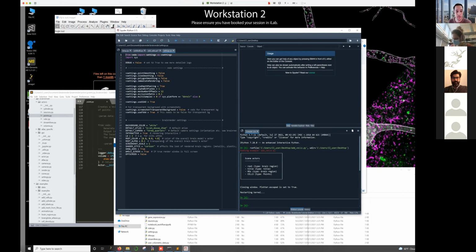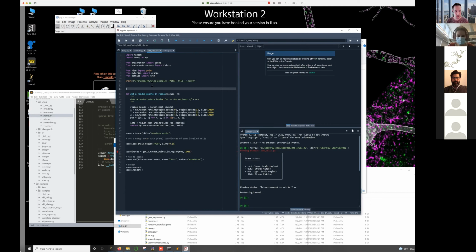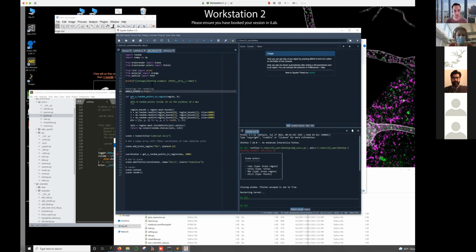Just as a main example, this whole screen thing, which is a bit annoying, just select that. You can copy this, and we can bring it back into our cells function here. We can put this up the top somewhere. These could be our settings for rendering, and we can start to modify them before the script runs.